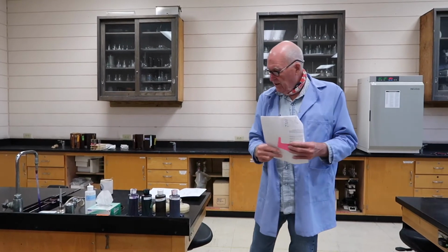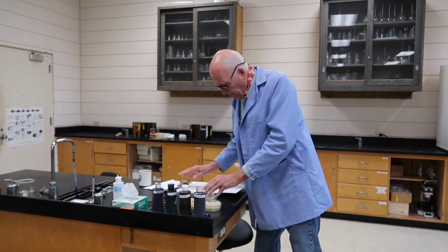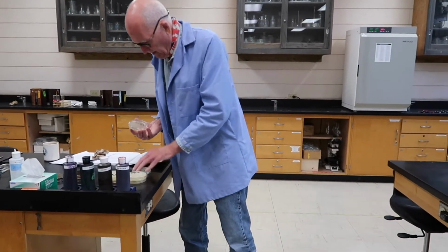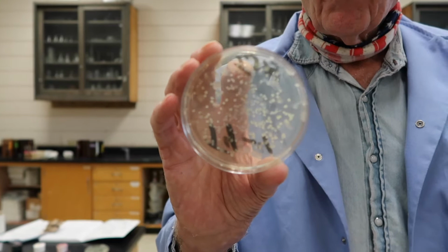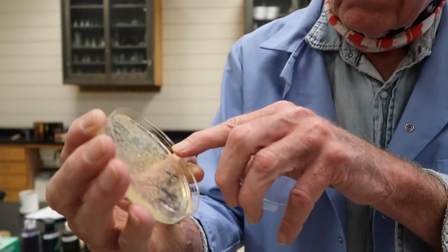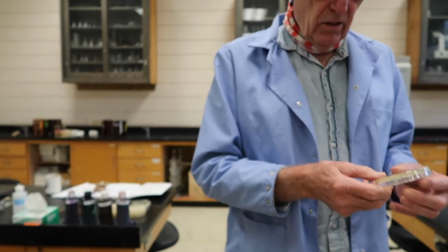Since I'll introduce you to dextran, I ran a couple. Let me see which one I want to use. All right, let's do this one. So there's 2 different organisms on here, but the one I want to highlight is this dextran. This was this big old slab. This was a T, we'll talk about dilutions later.